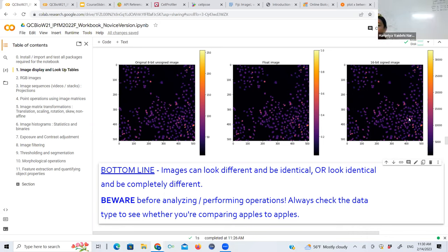The only thing you can't do is, say, for example, you've inverted it or you square every pixel. That's actually changing the pixel itself, I mean, the number, so we can't rely on that. Exactly. Like you're changing the relationships between different pixel values. Different pixels. Yep. That's not okay. But if you do it uniformly, that's okay. Yep. Thank you. Thanks for making that point clearer.